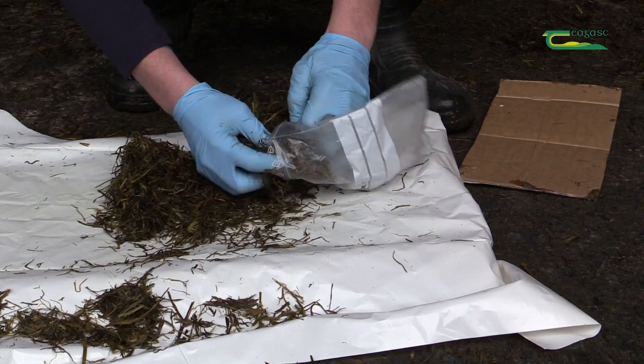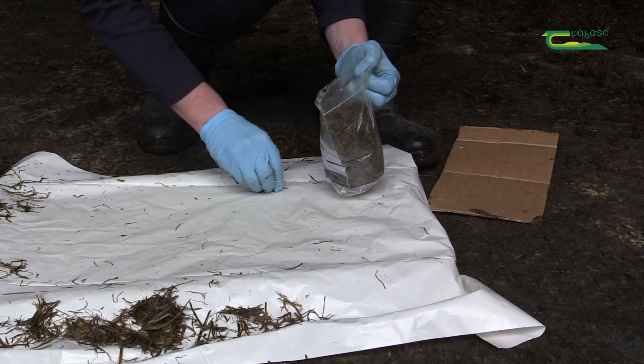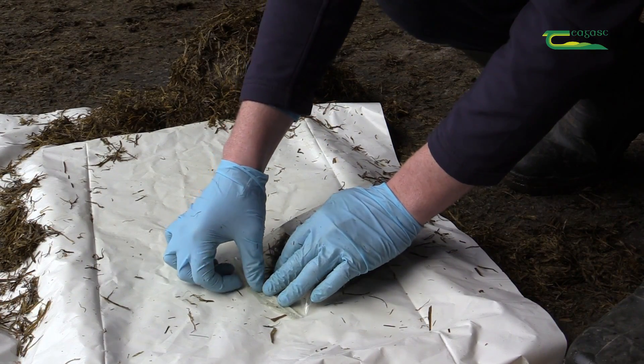Carefully place the silage sample into a clean, sealable plastic bag ensuring all the material of this pile has been included. After placing the sample in the plastic bag, remove as much air as possible by squeezing the bag and then seal.